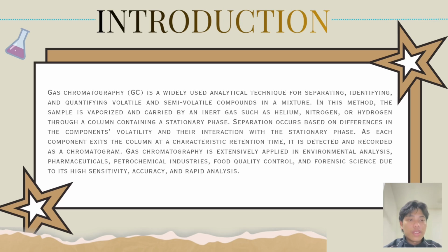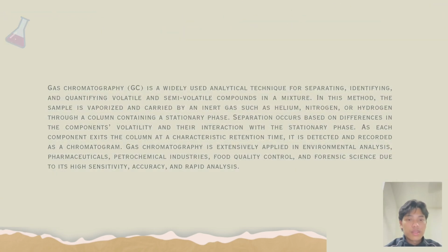Gas chromatography is extensively applied in environmental analysis, pharmaceutical, petrochemical industry, food quality control and forensic science due to its high sensitivity, accuracy and rapid analysis.